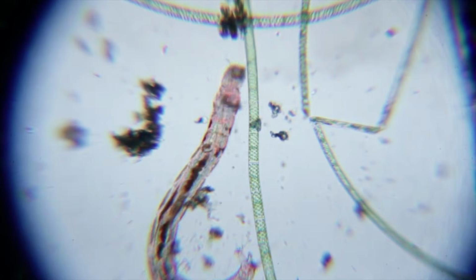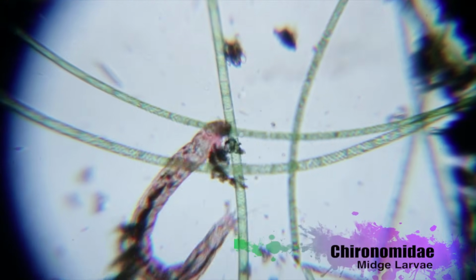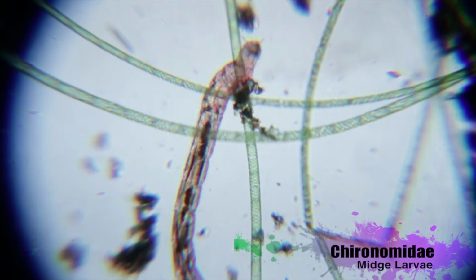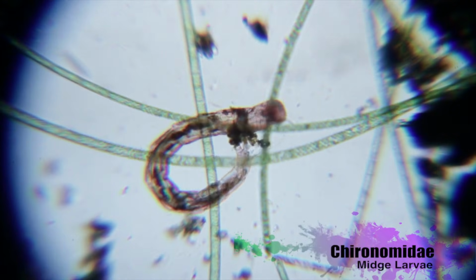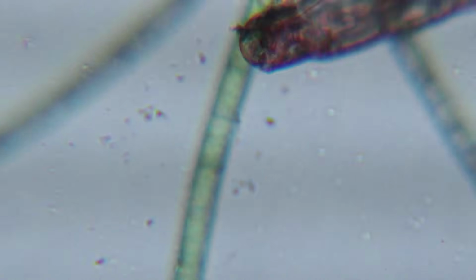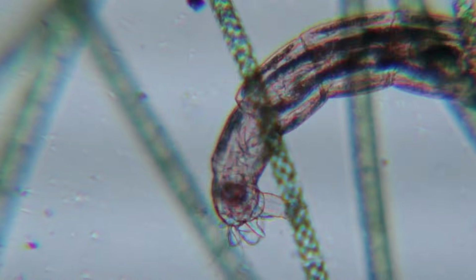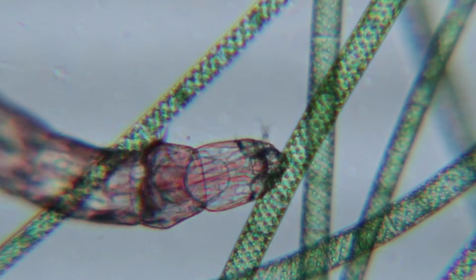This is the main predator that I found in the sample. It is the larvae of a midge fly, and currently this is being played back at half speed because he really does move fast. Let's return to full speed and have a look at him. This is his rear end or tail, and this is his head and his forepaws.